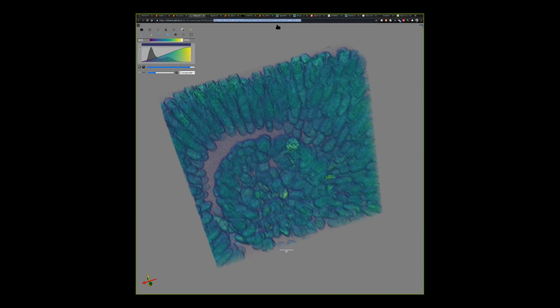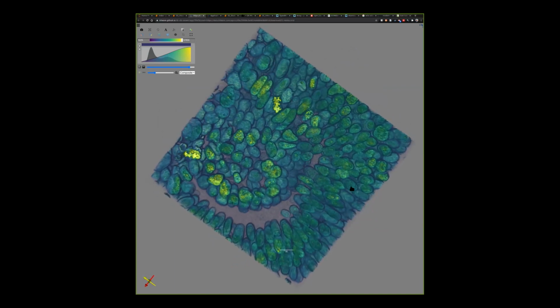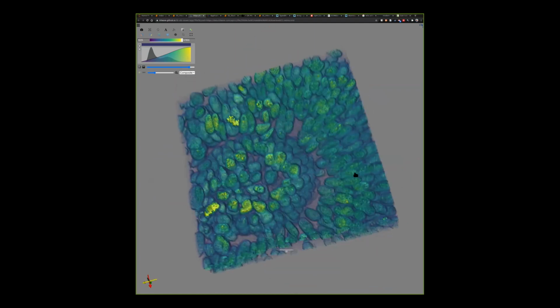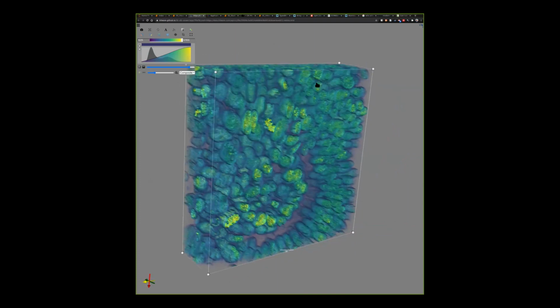There's actually some support for Zarr here too. That's a lazy loading of the data set and is capable of multi-scale visualization. I'm working on that capability more and more. You can see there are capabilities to select regions of interest in the data set.